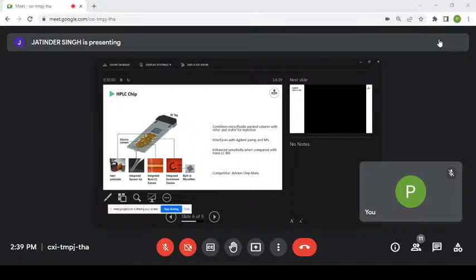You've got an electrospray interface, so the chip can spit its guts straight into the mass spec, so you can do LCMS with them, provided you can do LC on the chip. And Agilent wouldn't be Agilent if they weren't really good at it. So here's an example of one of the channels, and they pack particles inside the channel, so an integrated LC column. And they've even got a nice enrichment column to do solid phase extraction to concentrate the analytes before they get separated on the chip.